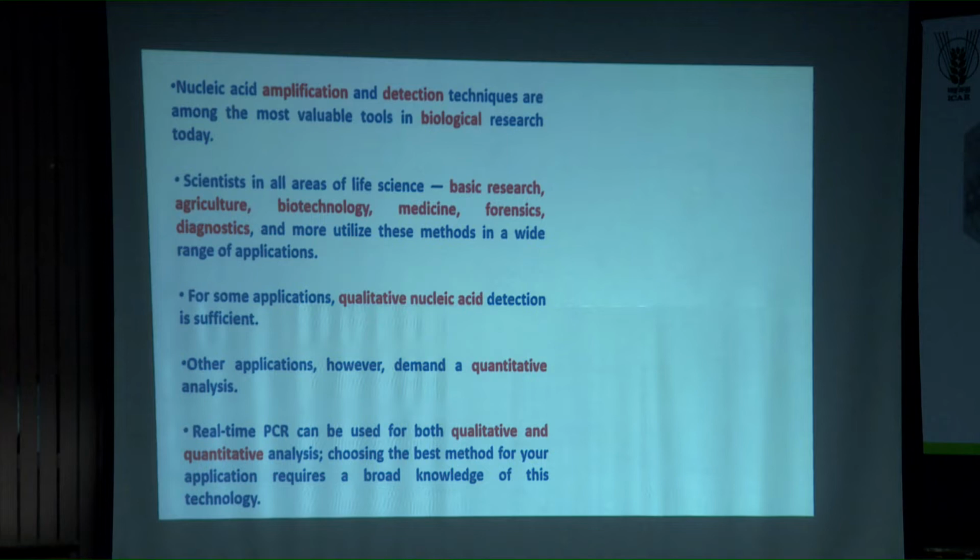Real-time PCR can be used for both qualitative and quantitative analysis. Having said that, real-time PCR is an addition over the normal PCR. That means qualitative analysis is possible in the case of normal PCR, but in qPCR, the added advantage is you can have this quantitative analysis also.